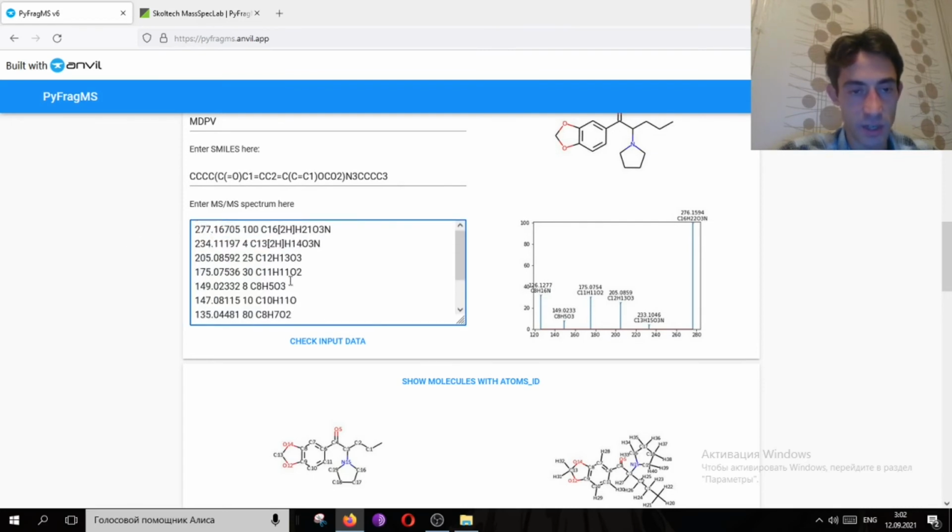Let's paste it here, and for our convenience, I just removed some data which were not used here, just for simplicity.